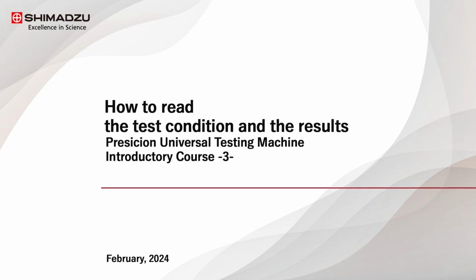This webinar explains how to set up test conditions according to the various standards and how to read the data from the test result.